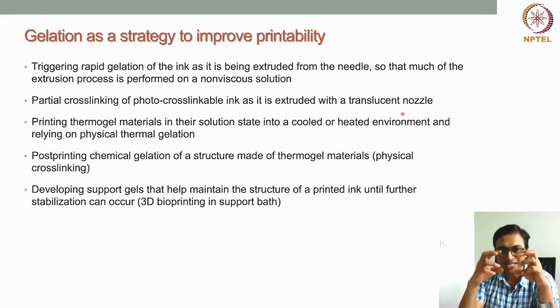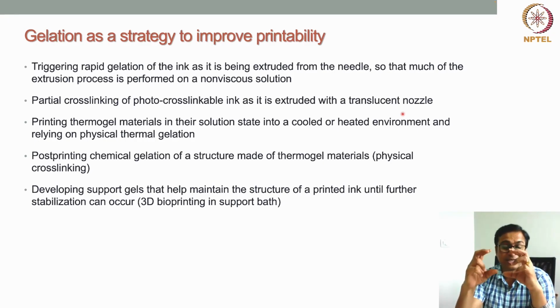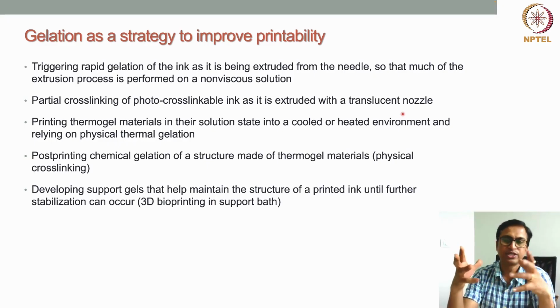That means the gelation starts within the extrusion nozzle itself, but it takes time, and when the material comes out of the nozzle the gelation is very fast, so the material solidifies immediately. The shape is retained very fast and the print fidelity would be very good in that case.